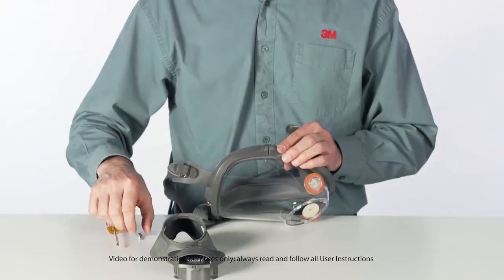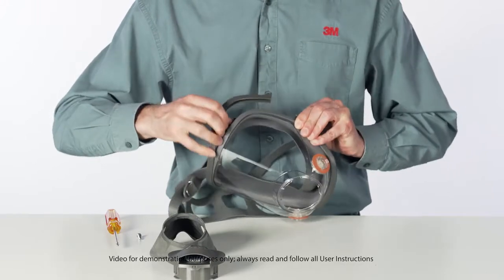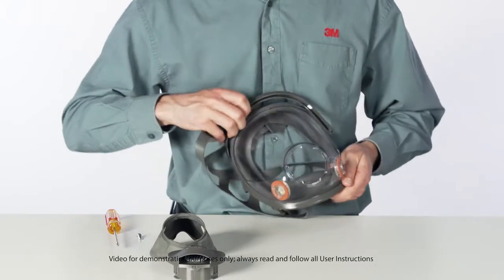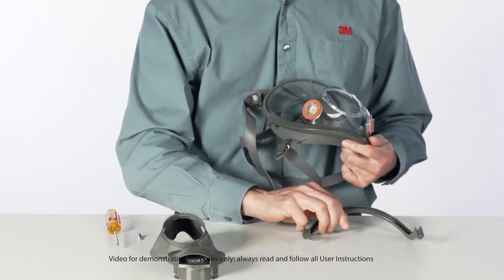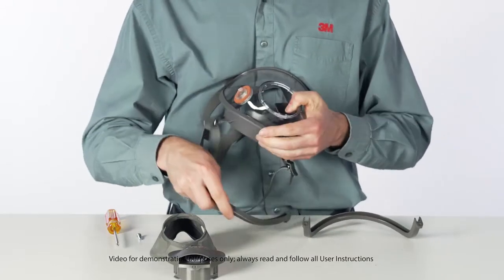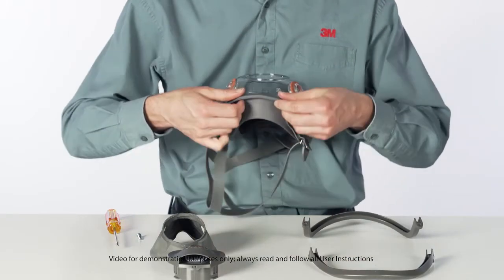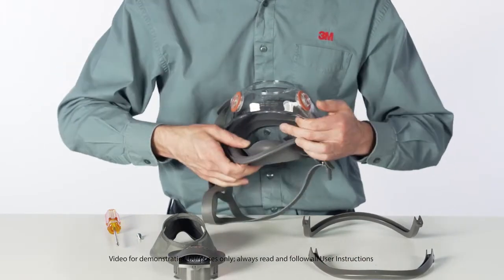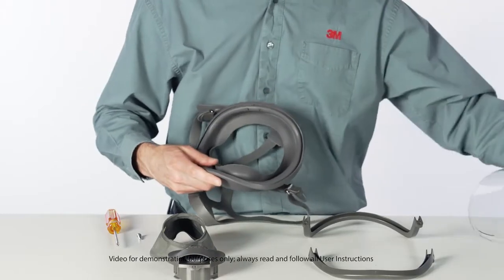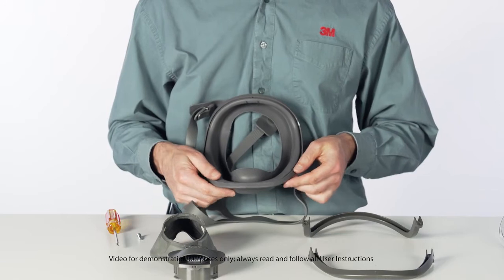Pull the frame top and frame bottom away from the face seal. Remove the face seal from the lens. Place the new lens and face seal together, aligning the marks at top and bottom.